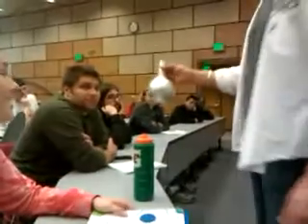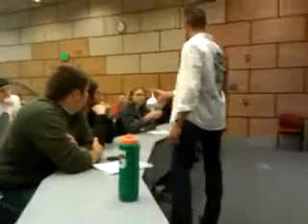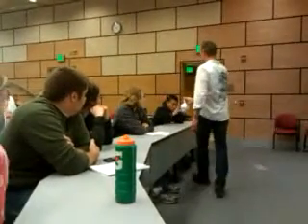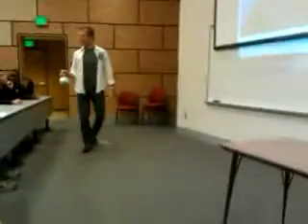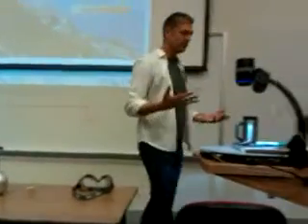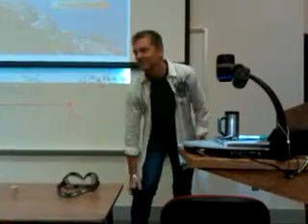Yeah, I can smell it. Not really. Feel it. Now trust me, it wasn't that warm. Well, now that's a 50-cent question. That'll get you $1. What was in there? Well, I'll show you what was in there.